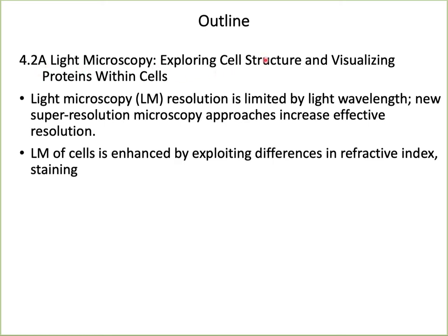4.2a, light microscopy, exploring cell structure, visualizing the proteins within the cell. Light microscopy, concepts of resolution and wavelength. We're going to talk about some of the approaches to increase the effective resolution, and we are going to talk about the refractive index and staining procedure as well.